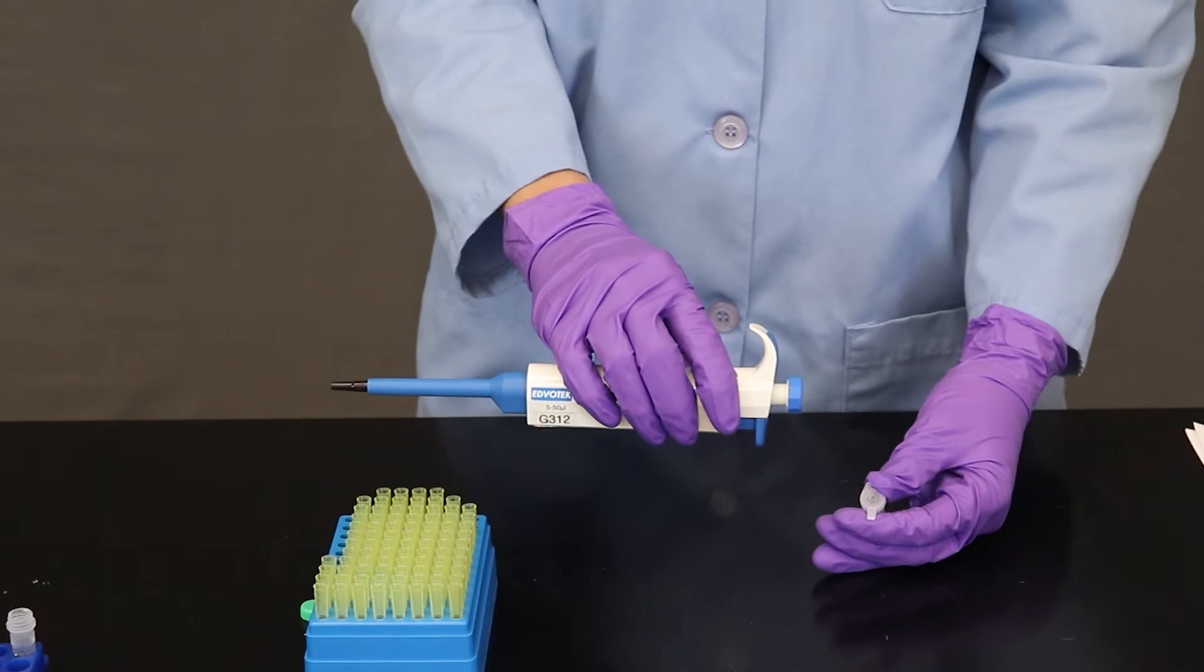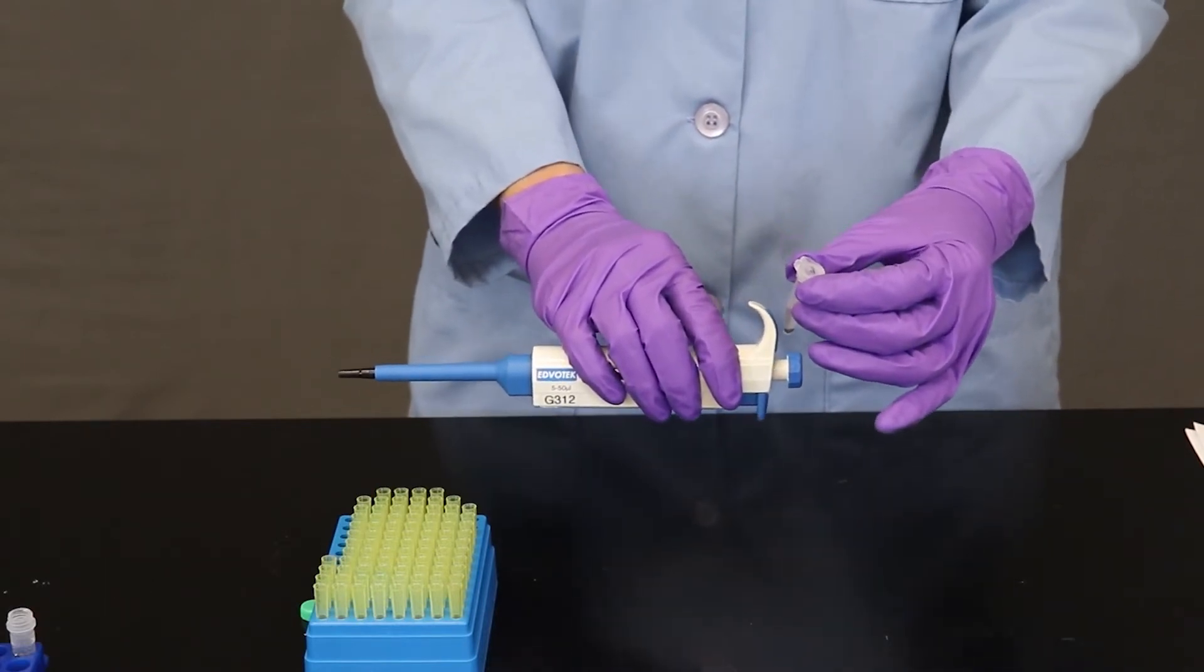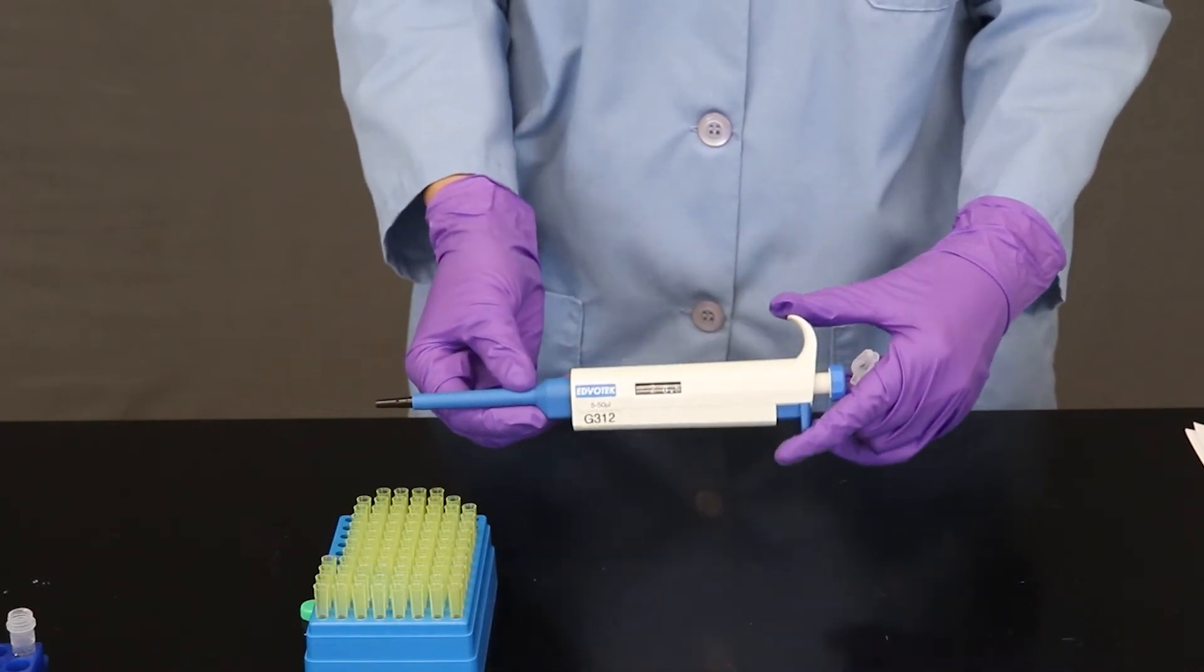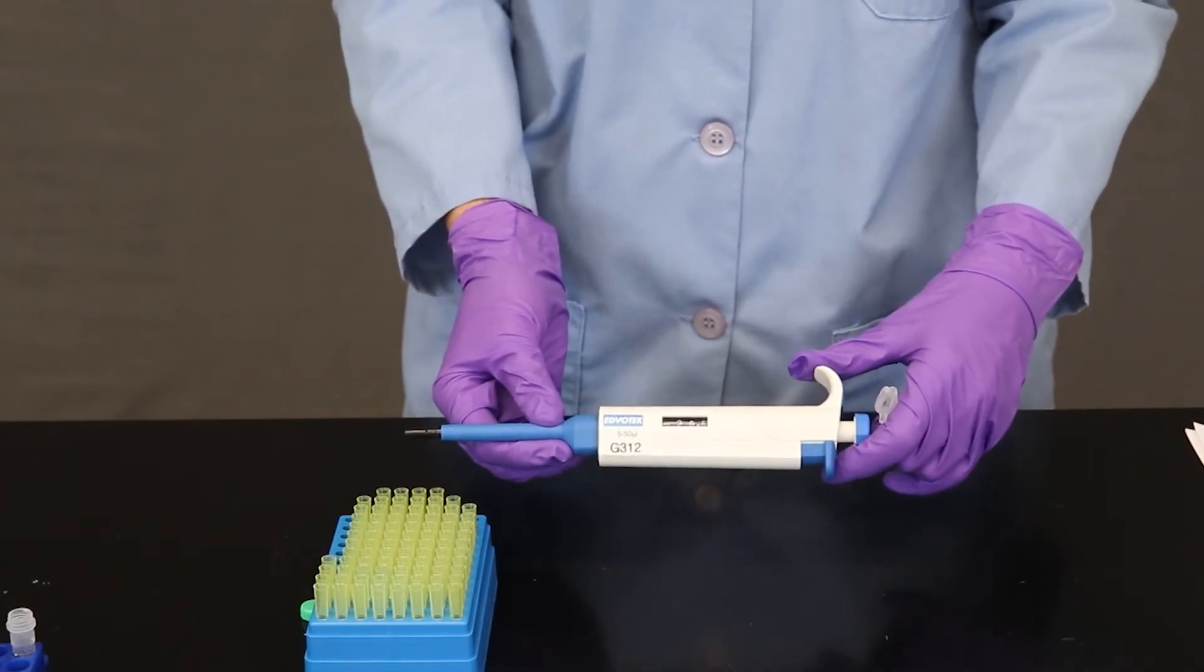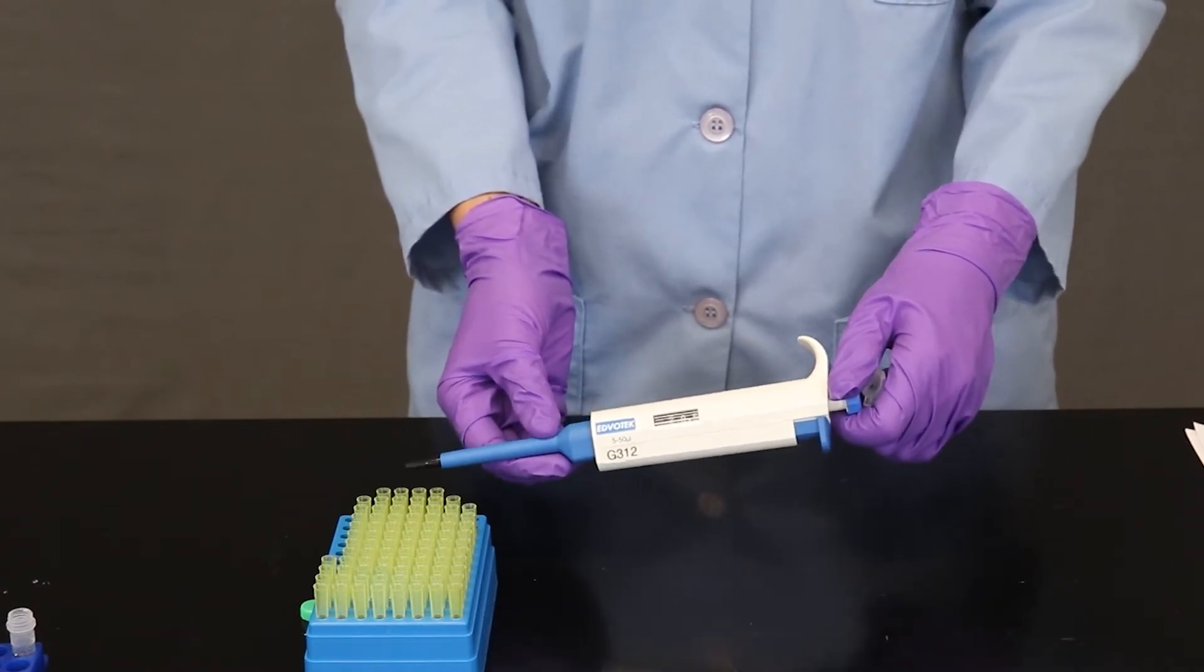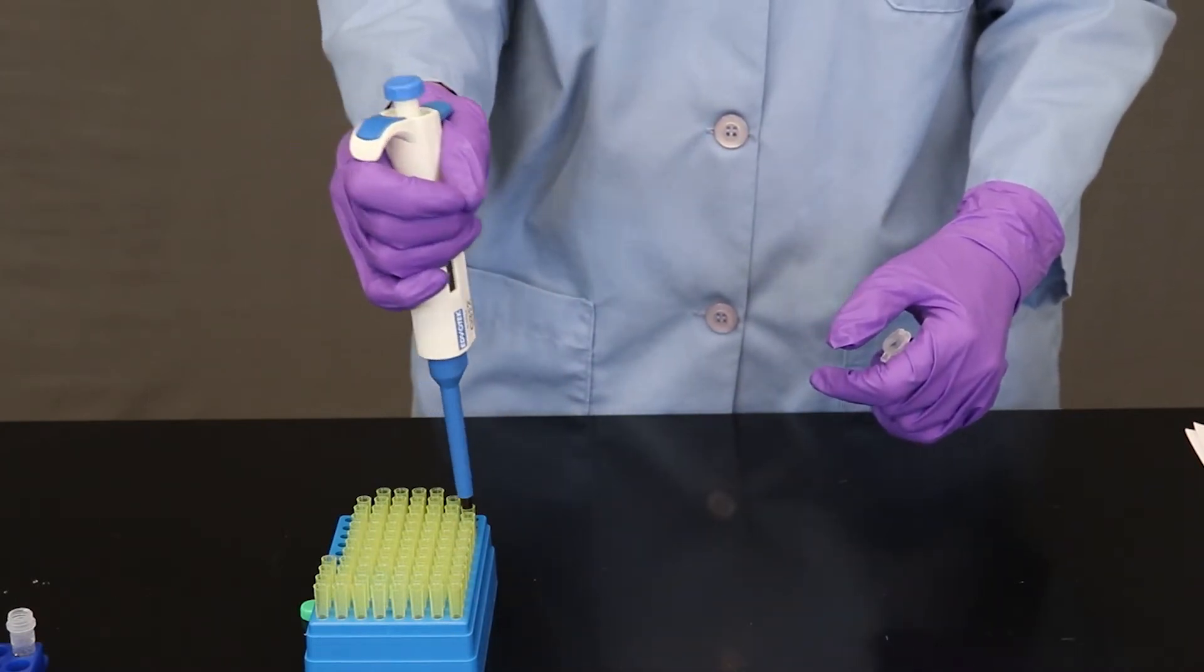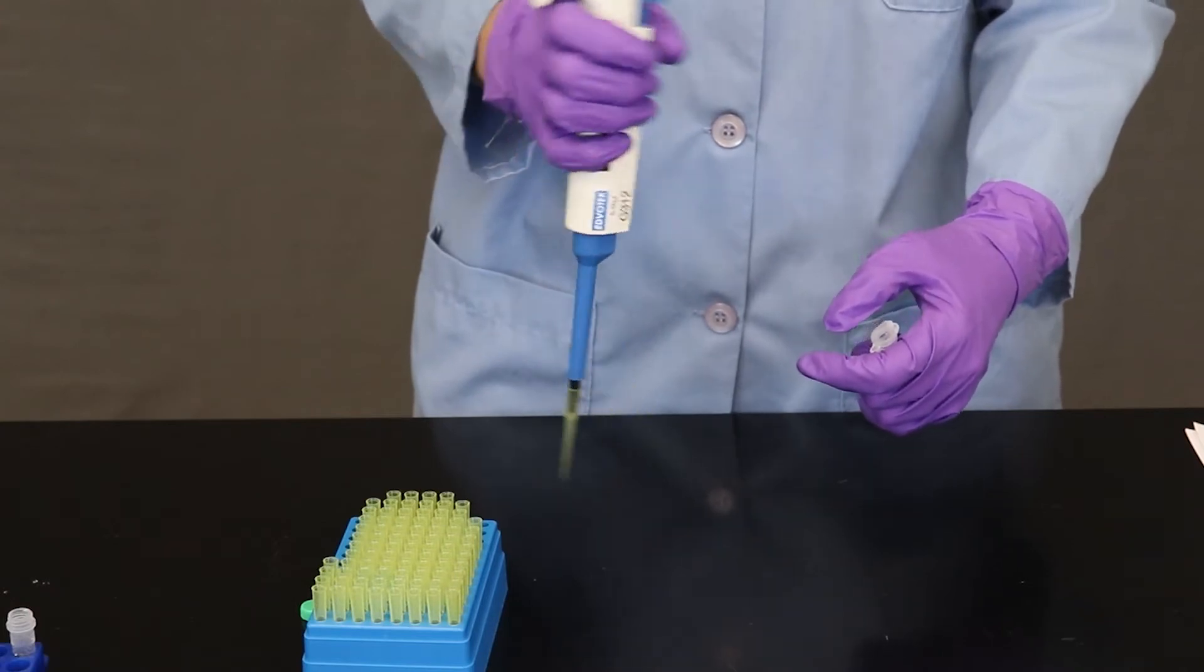Now I'm ready to add the proteinase K to our insect tissue. And I wanted to talk about the micropipetter tool that I'm going to use to measure out the small quantity that I need. So this particular micropipetter measures 5 to 50 microliters. One microliter is one one millionth of a liter, so it's a small quantity. And the micropipetters are always used with disposable tips. So I've added a tip to the micropipetter.